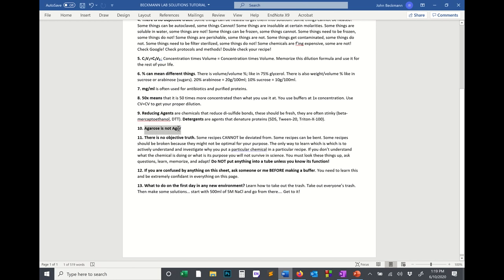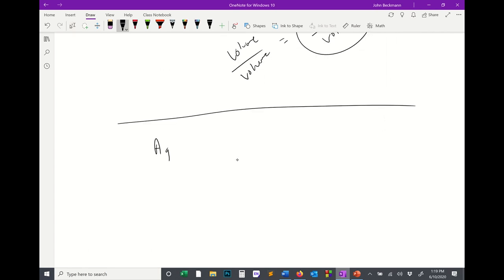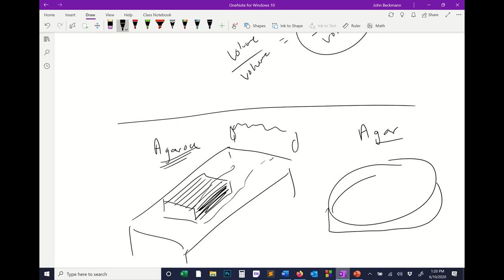Okay, point 10. Agarose is not agar. I made this mistake when I first started off, and I want to point it out to you so you don't make that mistake. Agarose is a chemical we use to make agarose gels. I drew that gel box out before. When we do gel electrophoresis, there's electrodes and they run a current. The thing that makes up this gel right here is agarose. Agar is what goes in plates, so microbiological plates. Agar is what goes in the plates and it makes them hard.